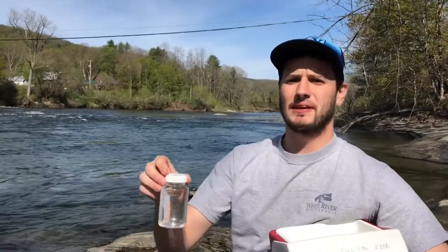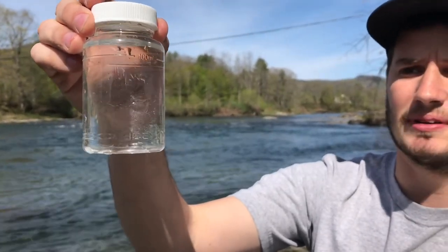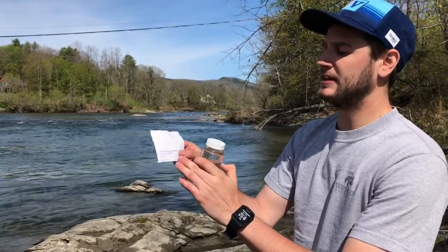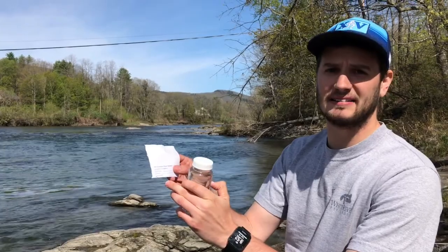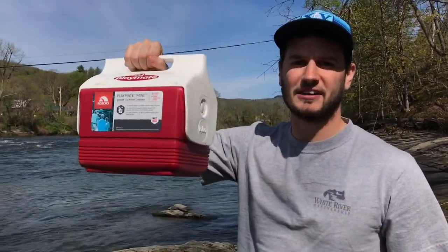Now that sampling is complete, confirm that you have over 100 milliliters of your water sample — we can't process the sample unless it's filled to at least the 100 milliliter mark. Once your bottle is dry, complete your data label with the date, time, turbidity, and conductivity, then adhere the sticker onto the bottle and get it in your cooler as fast as possible. And you're all set to go.